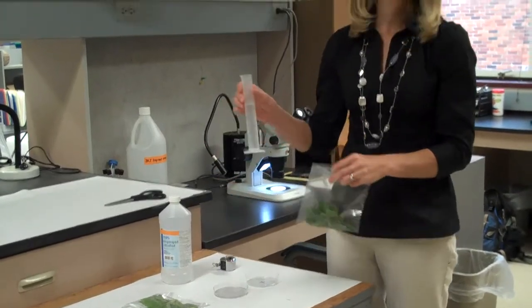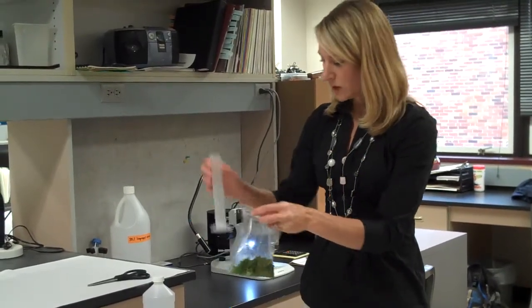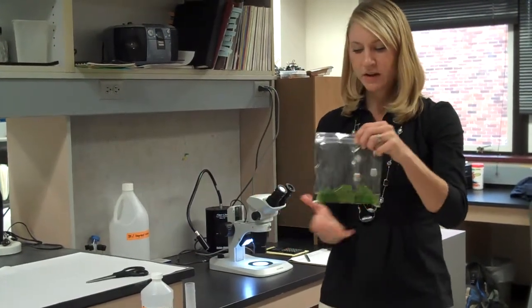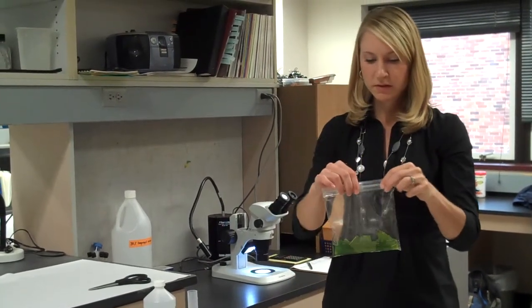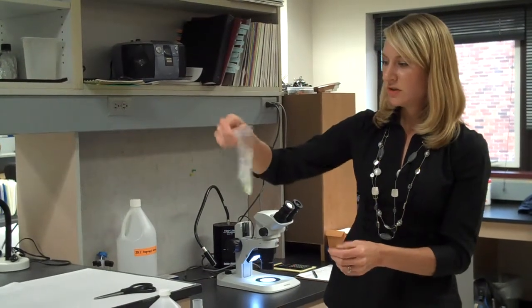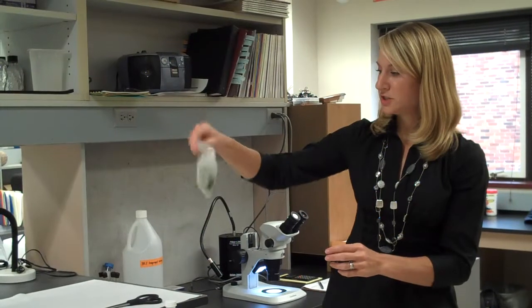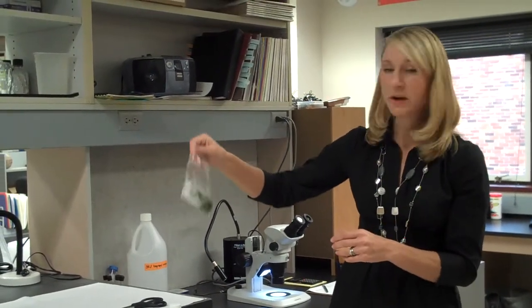Then we take our 35% isopropyl alcohol — about 45 to 50 ml — enough to cover the leaves but also to fit within our petri dish. We seal the bag and shake it vigorously for about 30 seconds. The key is to make good contact with the surface of the leaf tissue. The alcohol will actually break that surface tension and pull the mites off the leaf surface.